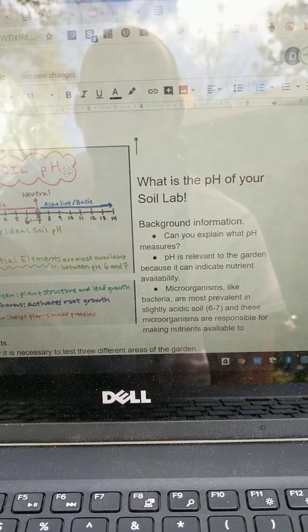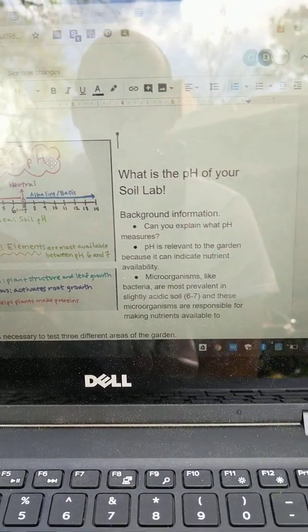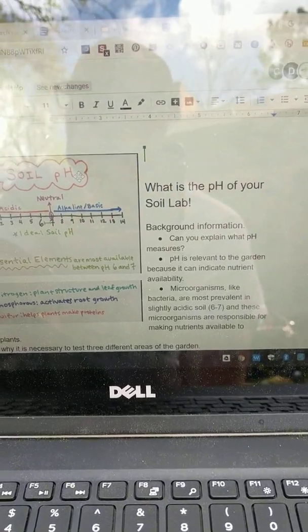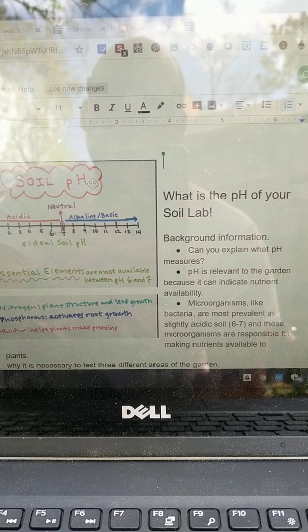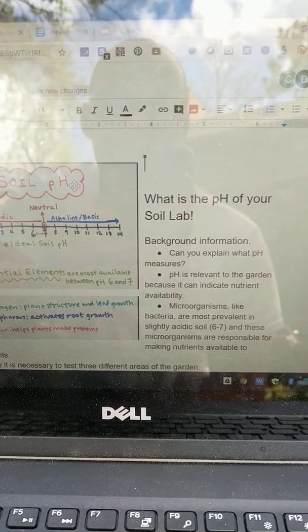Good afternoon, guys. I'm showing you a soil pH lab, and I'm going to walk through what I did if you missed the live event this morning.